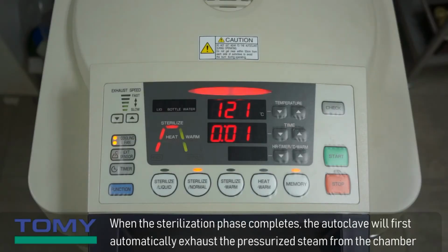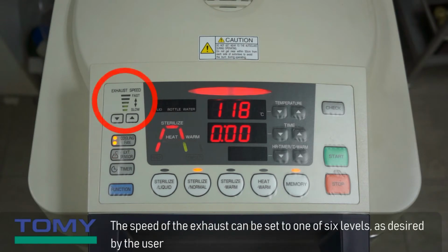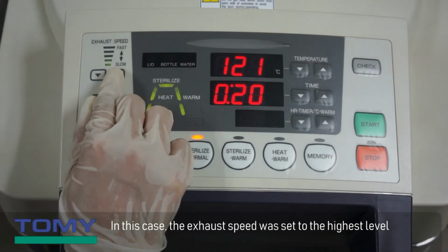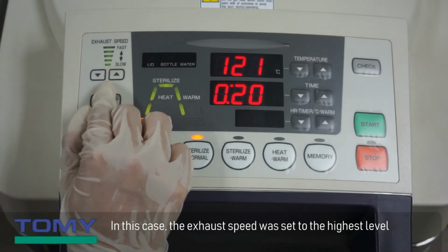When the sterilization phase completes, the autoclave will first automatically exhaust the pressurized steam from the chamber. The speed of the exhaust can be set to one of 6 levels, as desired by the user. In this case, the exhaust speed was set to the highest level.